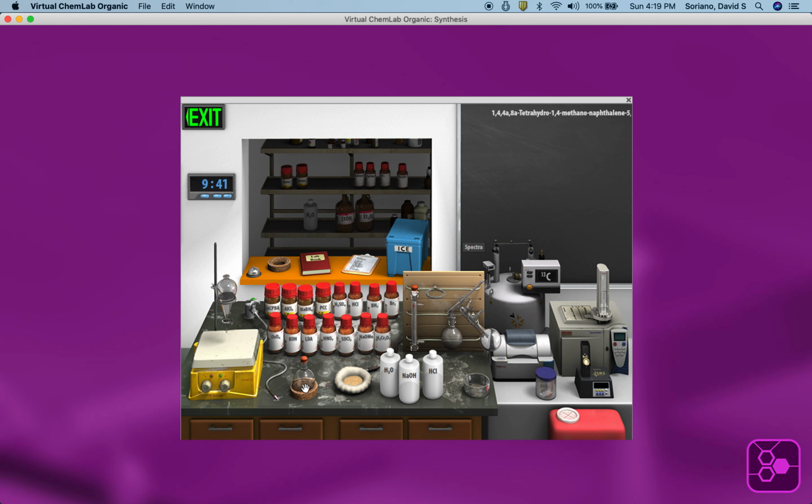And in fact, when you're first setting up the reaction to start, you can hit on that bell and your help section will open up. You can advance the time on the reaction, but if you do it too fast, the glassware could explode. So you should err on the side of caution. Try it a few times, you'll see what happens. If you're doing a reaction like an alcohol oxidation using PCC, then you would do the reaction in an ice bath, or a Grignard reaction, let's say, if you didn't want to heat it. And we'll do that in other videos.